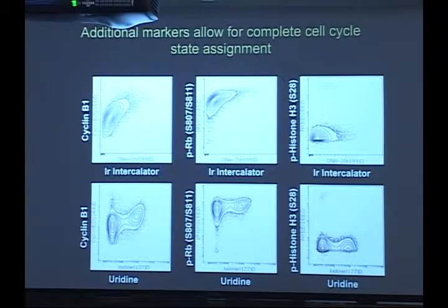And then phosphorylated histone H3, people use both the S10 and the S28. The S28 is slightly more accurate, but it defines this rare subpopulation here that's positive for phosphohistone H3 at a high level, and we already know from fluorescence studies that these are the M-phase cells, and so we're essentially just doing the same experiment here. So again, we can pull out G0, G1 here, S, G2, cycling cells versus G0 with the RB, and the M-phase cells. And we generally use the biaxial with iododeoxyuridine to define these.